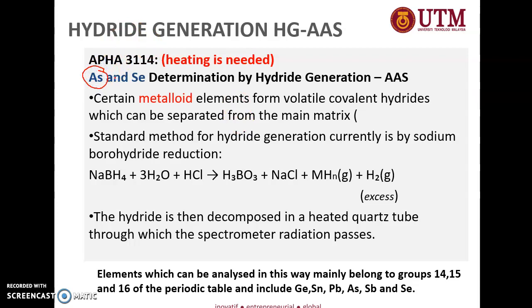Why? Because at high temperature metalloids tend to give low sensitivity, since sometimes they are not metal, being in the middle of metals and non-metals.